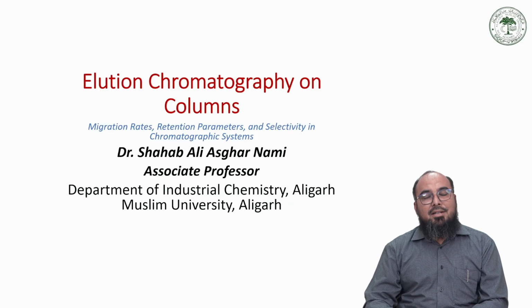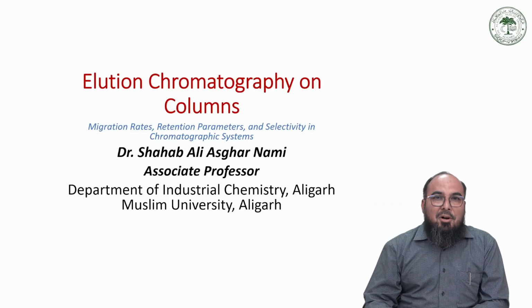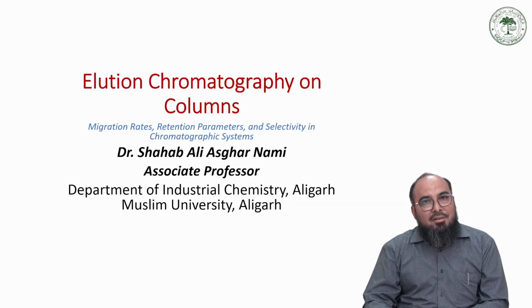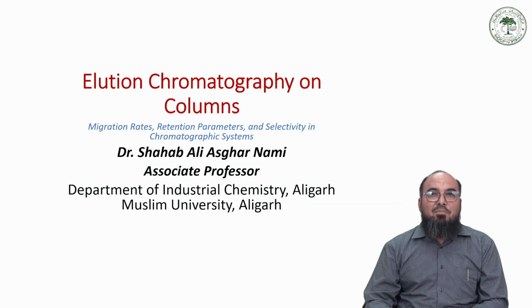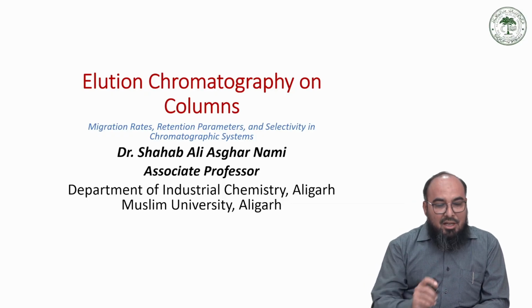So today we are going to extend our concept of chromatography, which we have already discussed in our previous slides about the introduction of chromatography, the basic principle of chromatography, and the classification of chromatography on the basis of the principle, on the basis of the format, and of course, the most important one, on the basis of the mobile phase. So today we are going to explore elution chromatography with regard to columns.